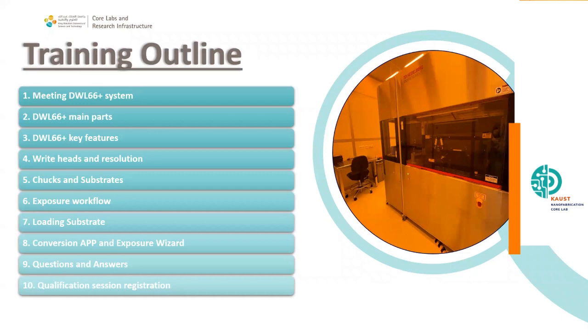This is the outline for the training today. I'm going one by one, starting with meeting the DWL66 system.